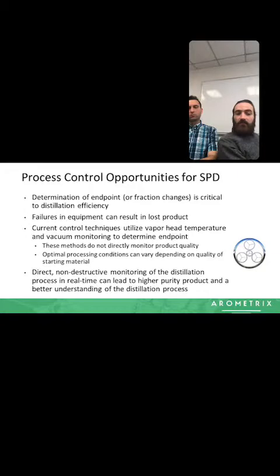So with that in mind, what we did is we tried to figure out, well, what's in the literature? There's not a whole lot in the literature if you look at fluorescence and absorption spectroscopy besides HPLC results, actually. So that kind of disheartened us, but we noticed that there was a suspicious lack of actual literature on this field since the 70s, because cannabis has become such a taboo subject, and it's been very hard legally to actually do research in this field.